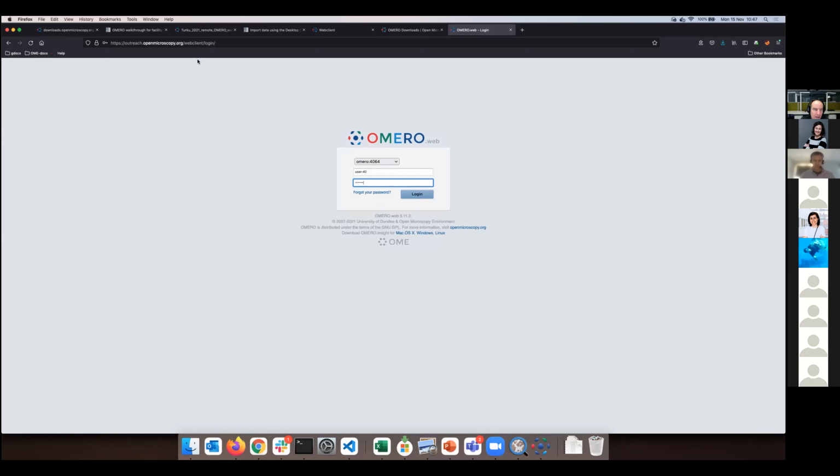So I'm now going to a URL. So this is basically an internet address, which is called outreach.openmicroscopy.org. And Jean-Marie will ping it again in the chat, I'm sure. And if I do that, I'm confronted with a login page. This looks very much like what I called splash screen in Omero Insight. And it's just another means how you are connecting yourself to a server, to an Omero server.